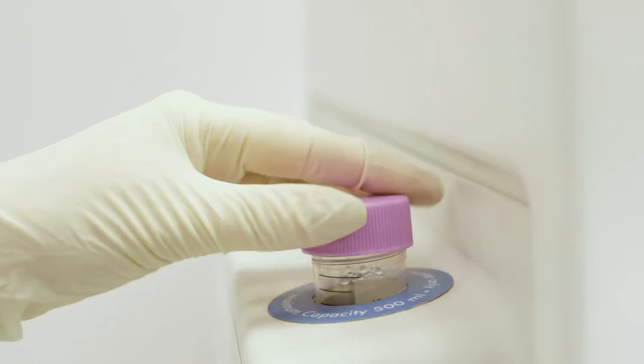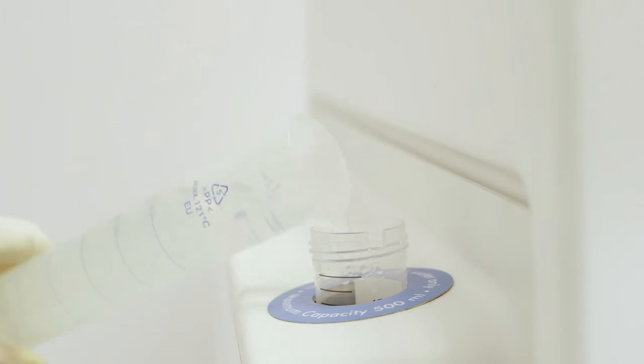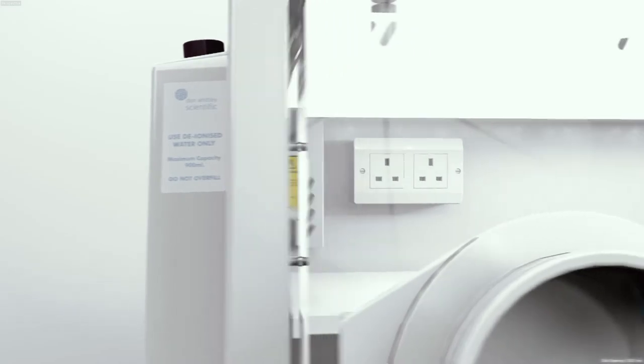The automatic humidification system adds sterile water vapour to increase humidity. This system is unique to Whitley hypoxic stations.